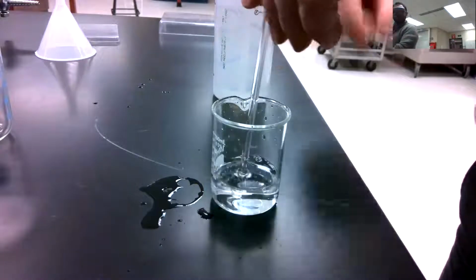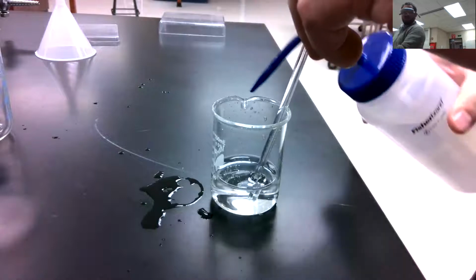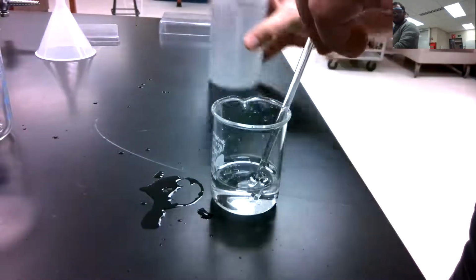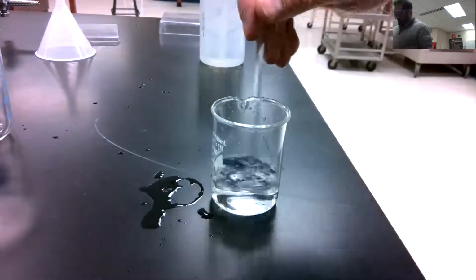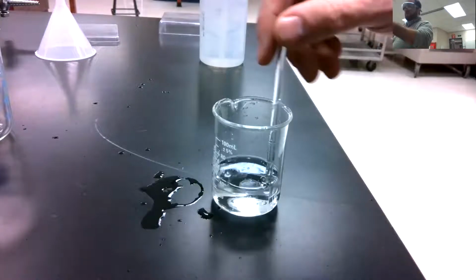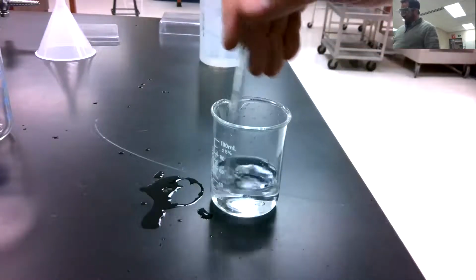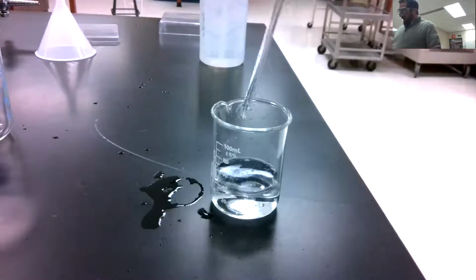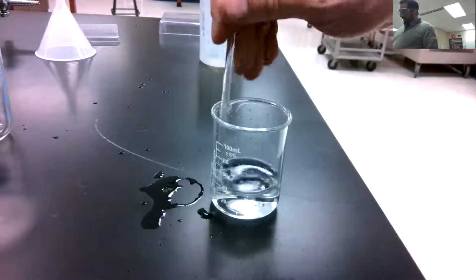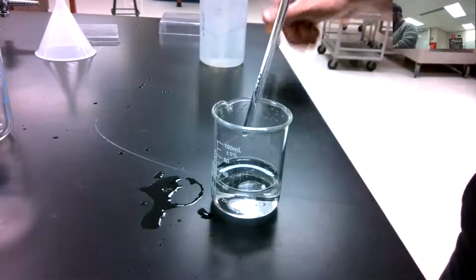We're using distilled water. You can see that here. Distilled water, that famous blue lid there. Distilled water is, theoretically, perfectly pure water. So we're not adding, if you get water from your faucet, you've got some iron flakes in there. You might have some nitrates in there from the ground. I don't want anything in here. I want my solution to only be the salts I'm putting in. And so I use that perfectly pure water.